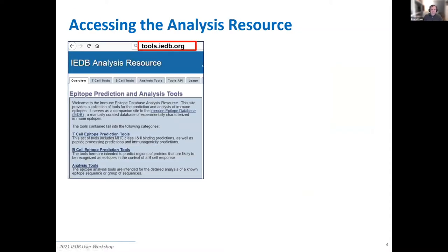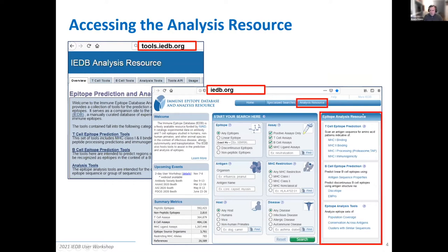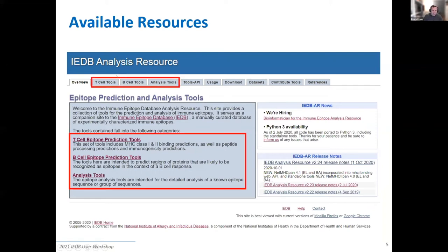To access the IEDB tools, the easiest way is to go to tools.iedb.org, and you go straight to the tools page. You can also go to the iedb.org homepage, where on the right you have a link to the analysis resource. You can jump directly to the different categories of tools, or go to the menu that takes you back to the tools.iedb.org page. This page is our analysis resource homepage, with the main categories: T-cell epitope prediction, B-cell, and analysis tools.